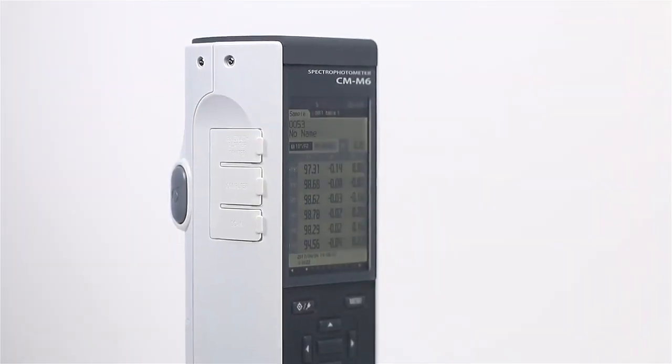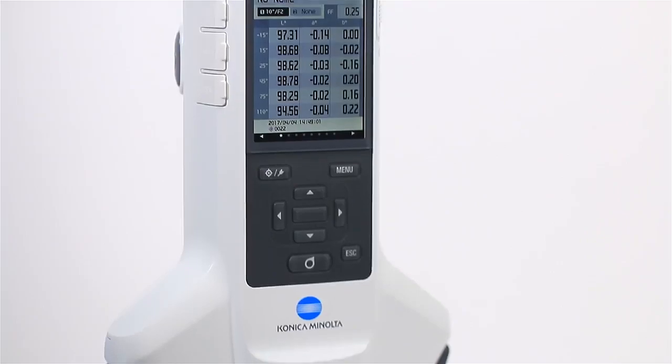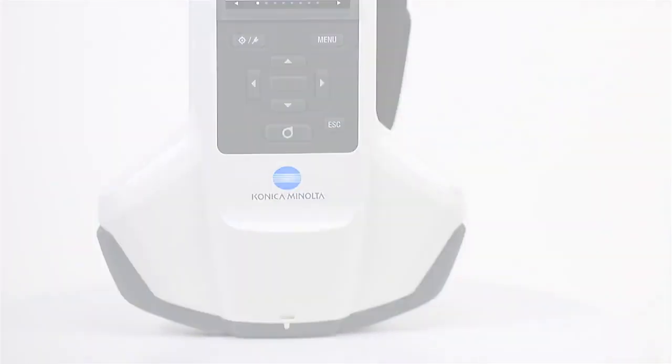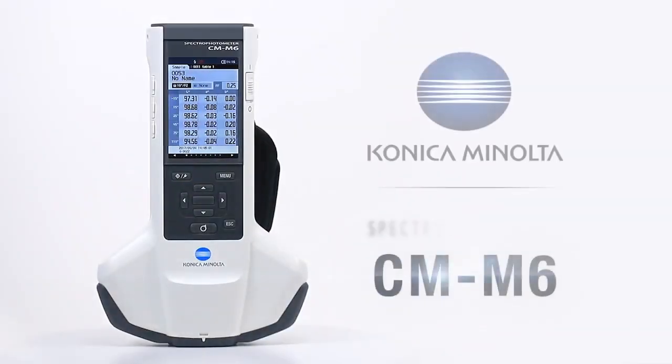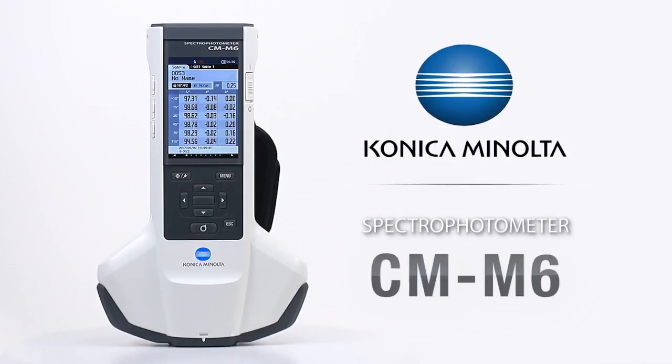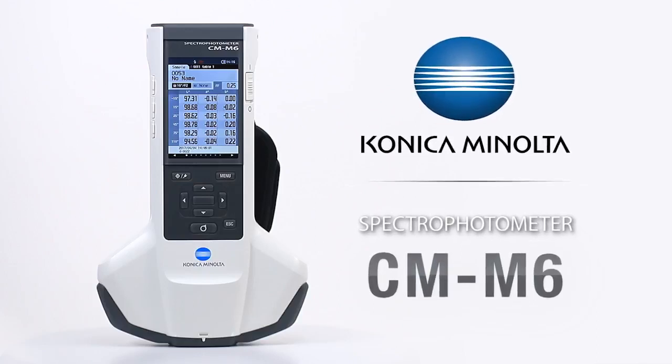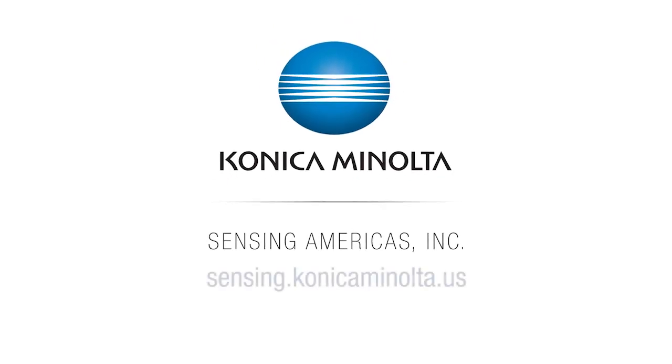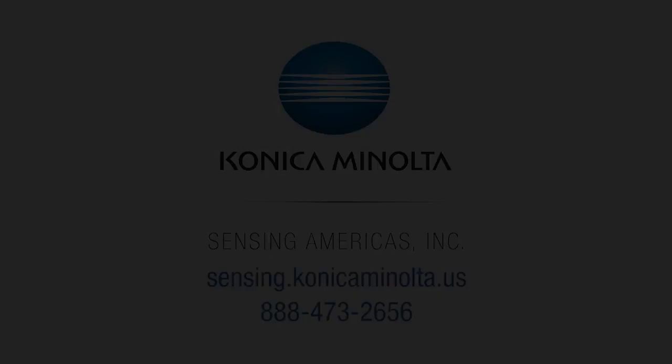Konica Minolta Sensing's CM-M6 is a repeatable multi-angle spectrophotometer for precise color measurement. To learn more, visit us online at sensing.konicaminolta.us or call 888-473-2656.